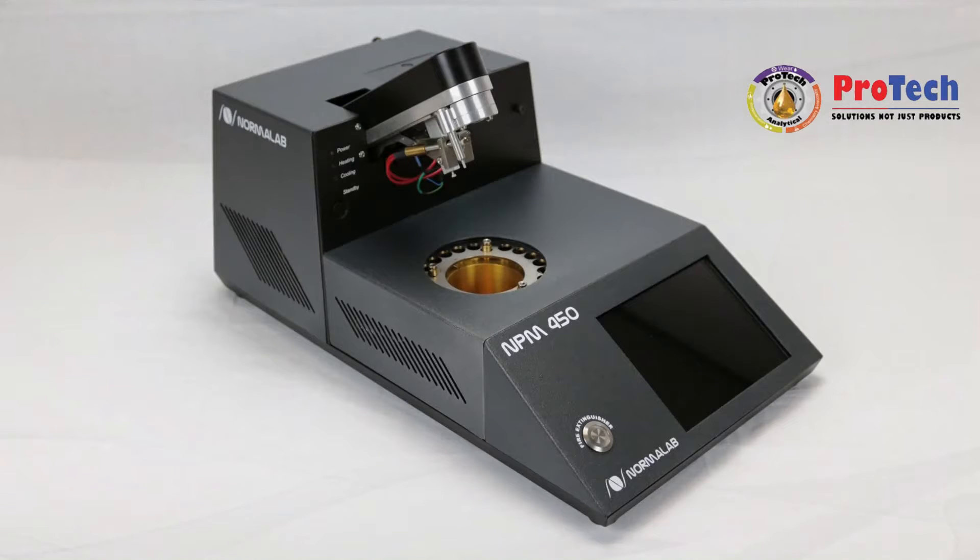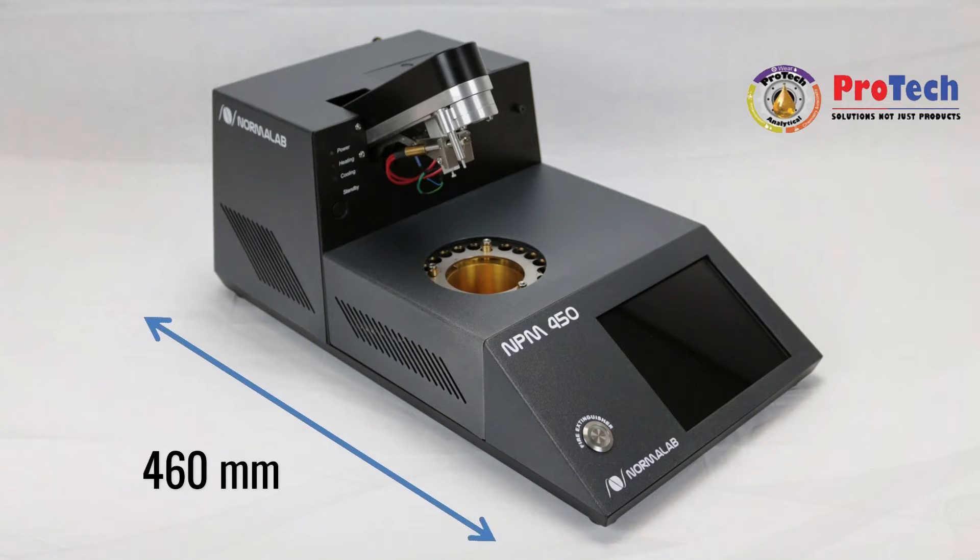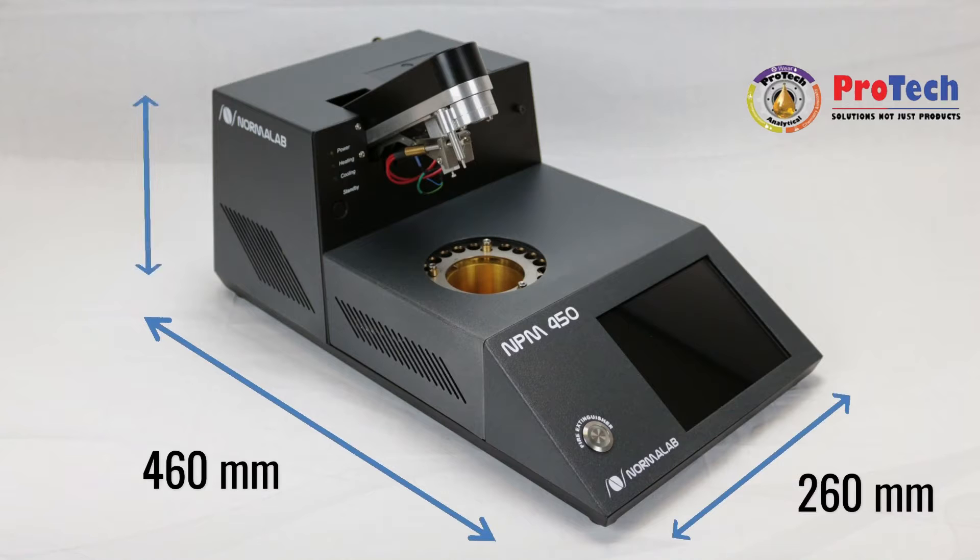Unit dimensions are 460mm long, 260mm wide, and 185mm high.